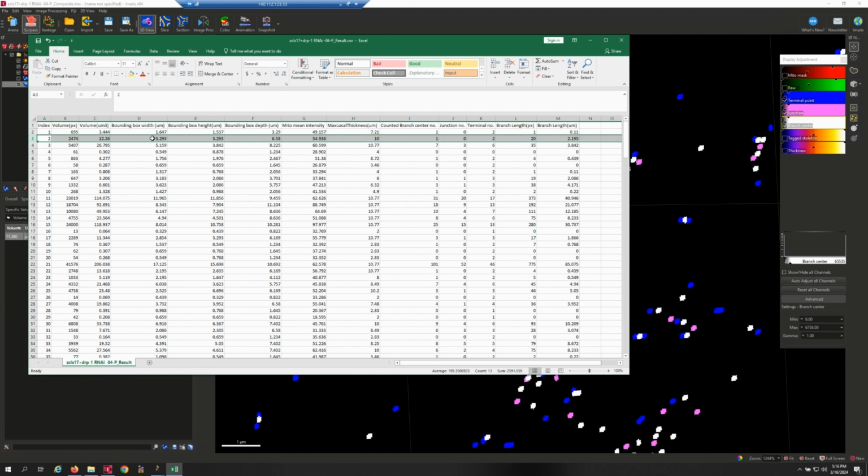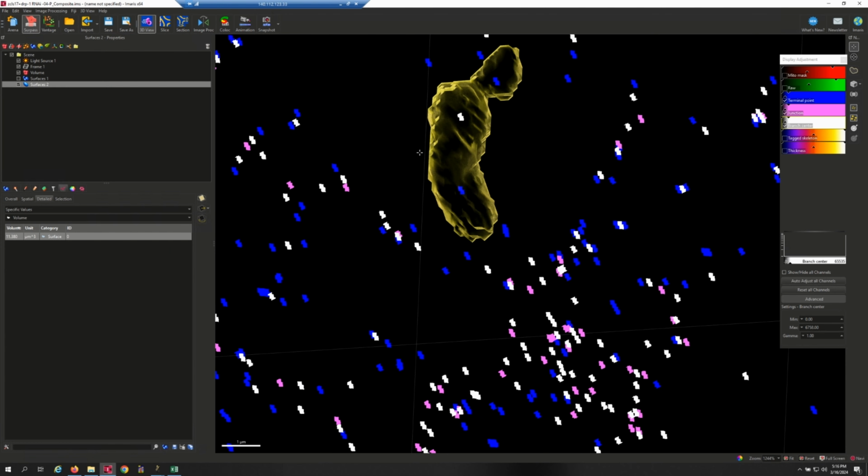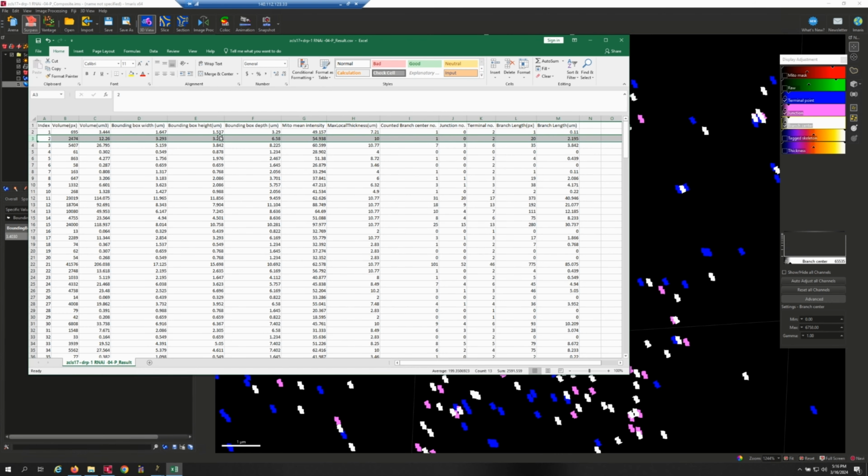Then, regarding the bounding box, we now need to use a box to enclose this 3D object. And along different orientations, what exactly is the size of this box? So, we can find the length of the bounding box here. So, the x-axis is 3.4, the y-axis is 3.4, then the z-axis is 6.9. Let's take another look. The bounding box, 3.4, 6.9, it's roughly the same. Similarly, the multiplier we use has a slight variation. So you might notice a slight numerical discrepancy.